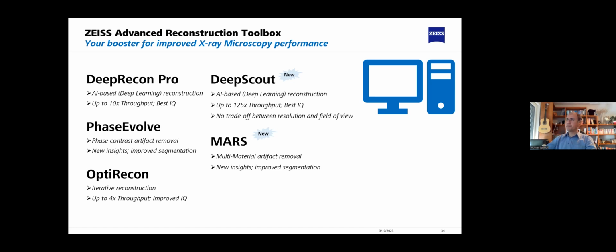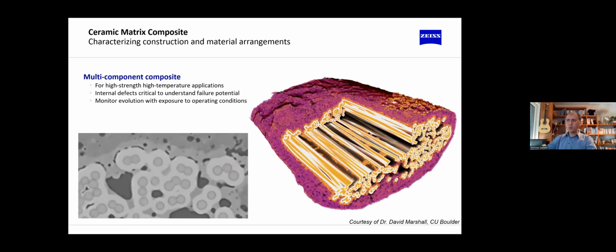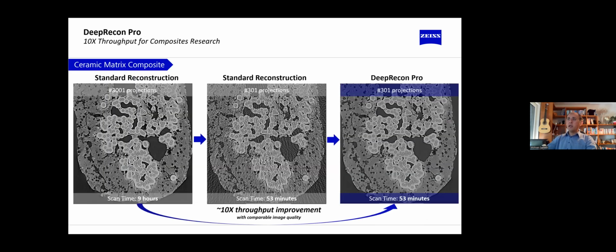So that's an example of a fiber-reinforced composite material, full quality, 3000 projections, and that took almost 9 hours to visualize. Fibers are perfectly visible, no quality issues. However, in case time is an issue, for example due to in situ experiments, we need to reduce the scan time dramatically. Now we have two virtual 2D cuts and exports of those slices here. As you see, with the full 3000 projections, we have a nice virtual 2D export, but it will take 9 hours to have those results.